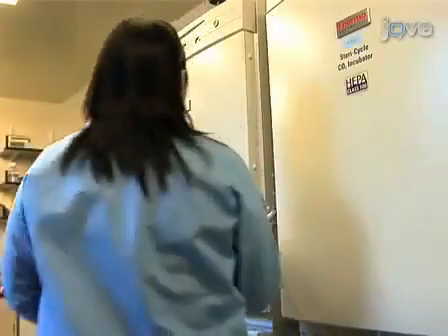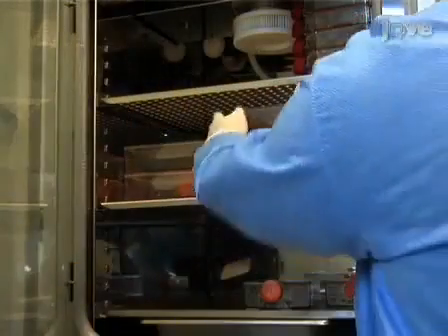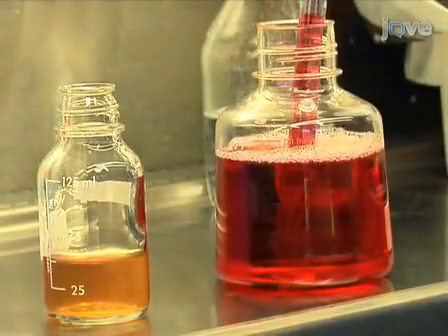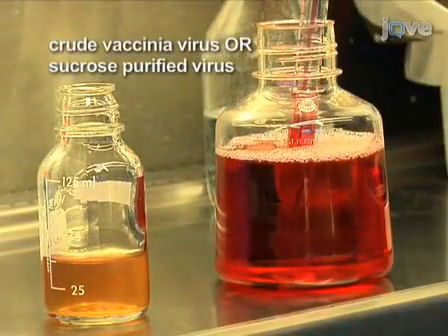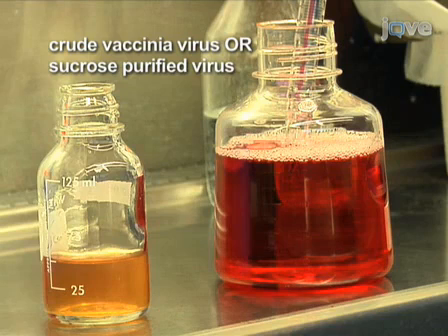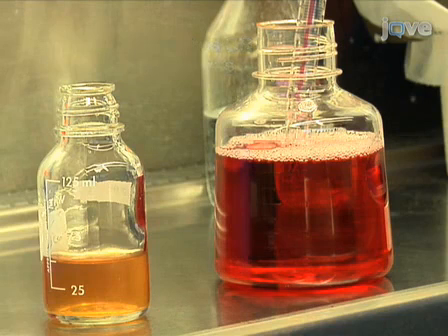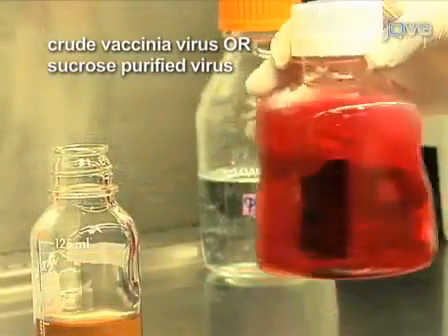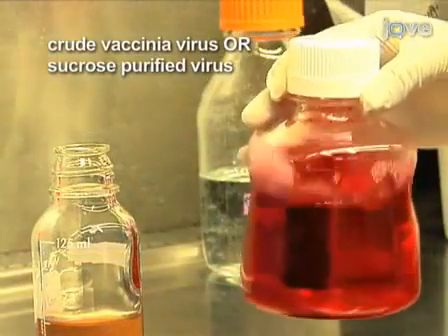To set up for the infection, grow HeLa cells in flasks and wait until the cells are approximately 80% confluent. Next, be sure to prepare enough viral growth medium for the experiment using regular DMEM with 2% FBS and no added antibiotics. The infection can be performed with either a crude stock of Vaccinia virus with a known titer or sucrose purified virus with a known titer if you're concerned about host gene expression.